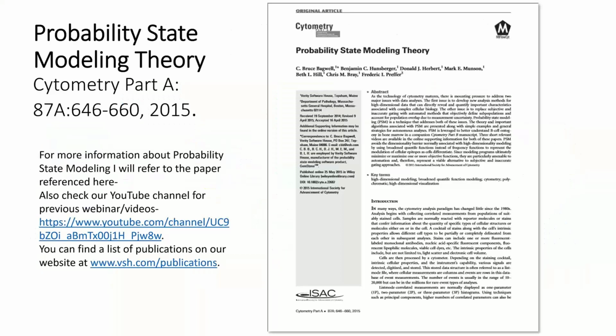The engine that runs GemStone is called probability state modeling. To the unfamiliar or for review, I refer you to this paper, as well as our YouTube channel, where you can find previous webinars and videos. You can also check our website for publications here.